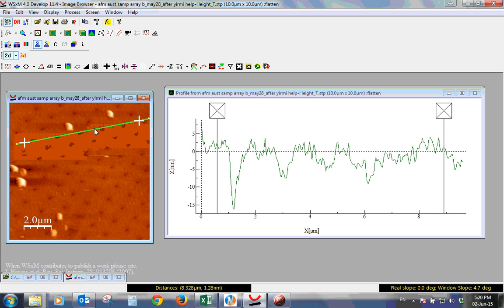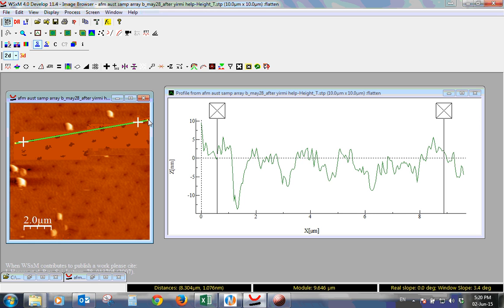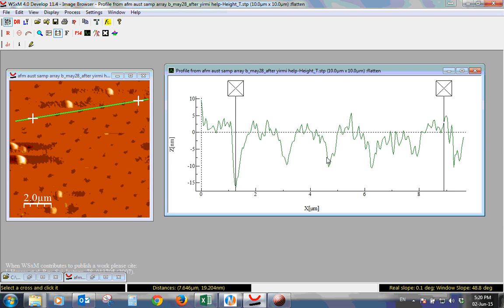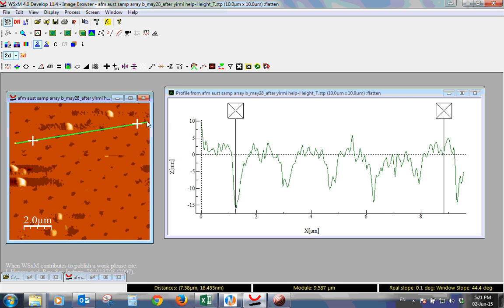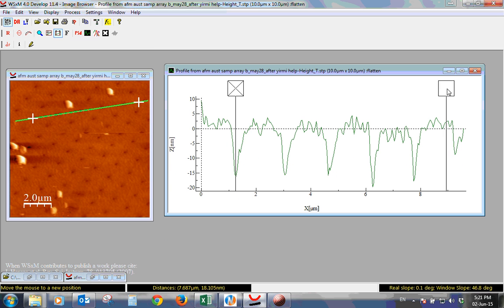So let's go here. Here it is dusty where it is blocking. Take this down here. Let's go here. 1, 2, 3. 1, 2, 3, 4, 5. Here it's also about 8. So let's keep it for 8 for right now, and then after we do another scan we can always continue to fine tune it. So here we see that we get 8, but it's supposed to be 6.